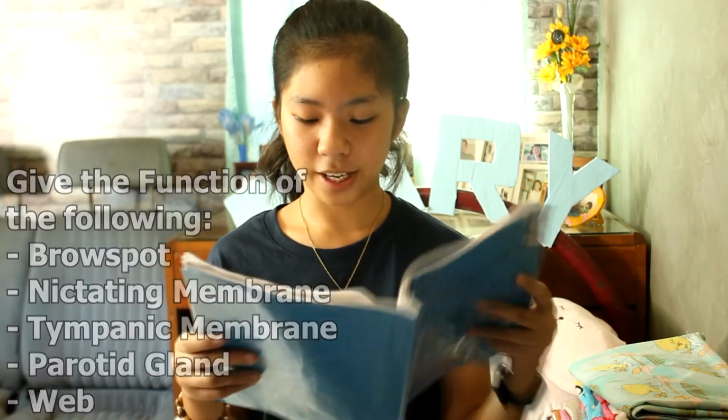Vestigial means the last part of something that remains, that has existed before, and can be the smallest possible amount of something. So, vestigial eye. Next is the nictitating membrane. As said earlier, the nictitating membrane is the transparent covering of the lower lid, and it lubricates the eyes to help the frog see both on land and in water.